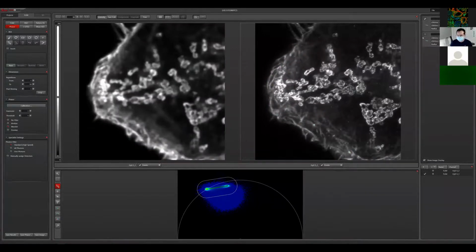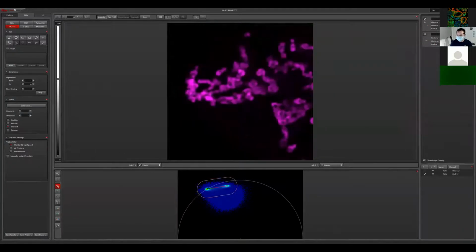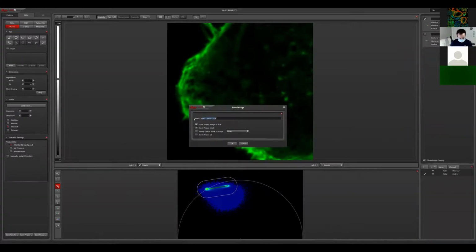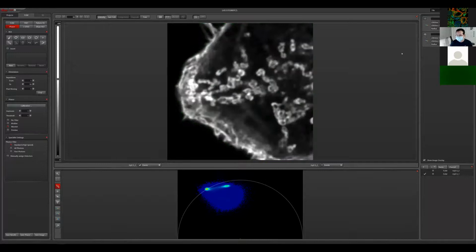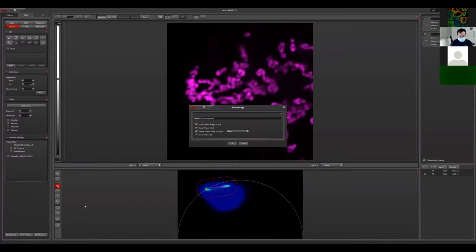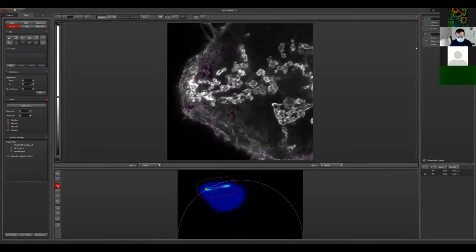Yeah, it's done. So you can see in the confocal image using Phasor, I can switch very easily between the two dyes, so I have no problem there. I will just put here actin to save it for later, and then also confocal 20. And now we go to the interesting part, the STED image.